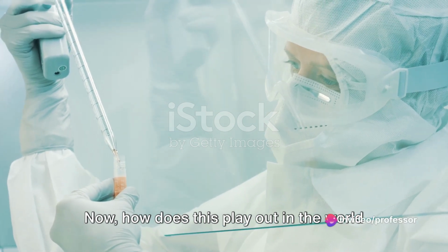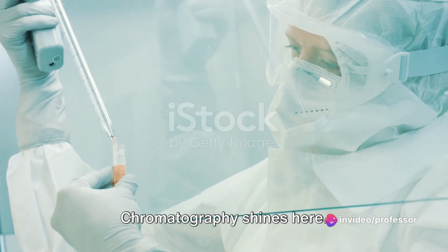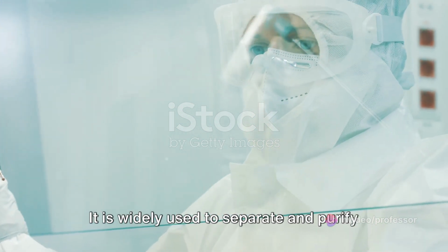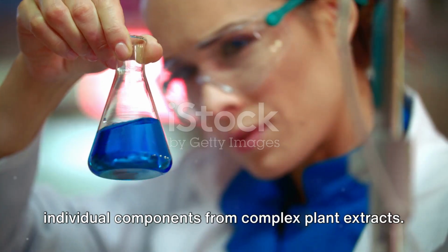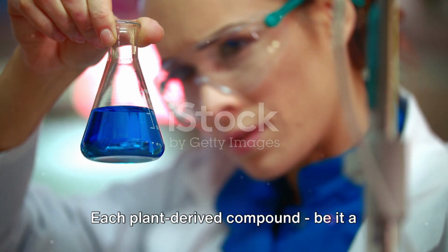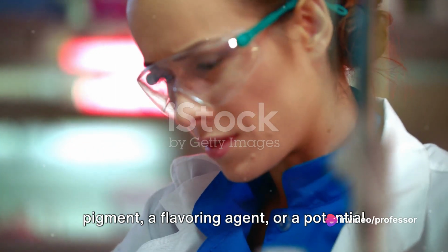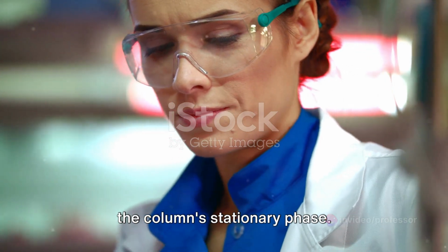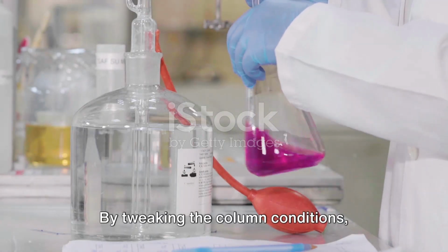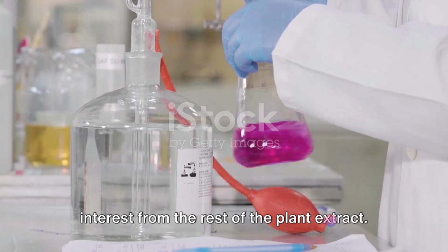Now, how does this play out in the world of plant-derived products? Well, column chromatography shines here. It is widely used to separate and purify individual components from complex plant extracts. Each plant-derived compound, be it a pigment, a flavoring agent, or a potential new drug, has its unique interaction with the column's stationary phase. By tweaking the column conditions, scientists can isolate their compound of interest from the rest of the plant extract.